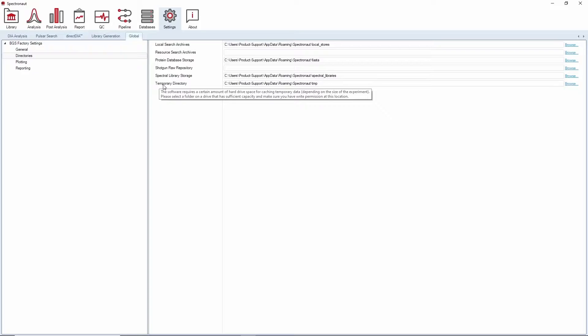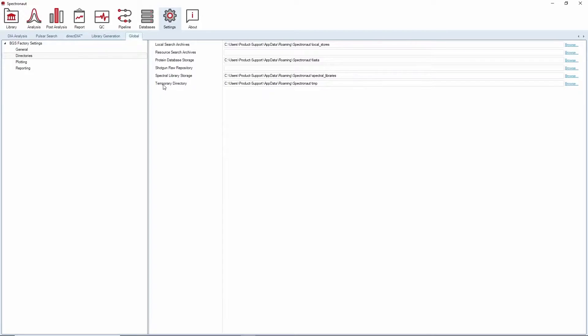We also recommend that you convert your DIA runs into HDRMS files, a file format that we specifically developed for the fast processing of peptide-centric DIA analysis with Spectronaut.